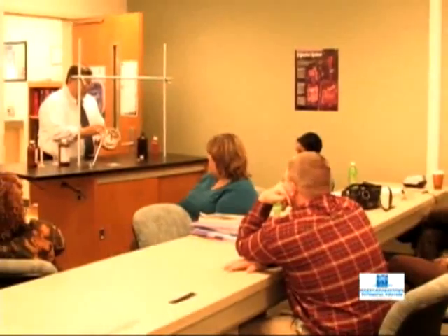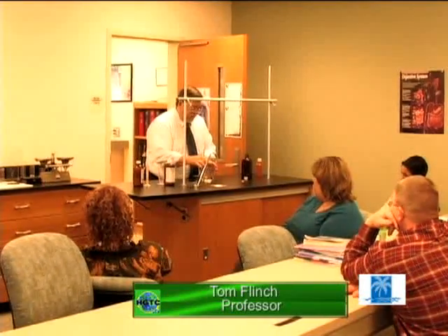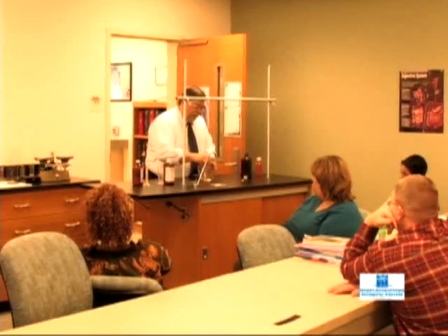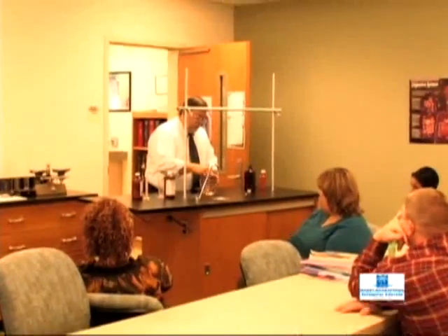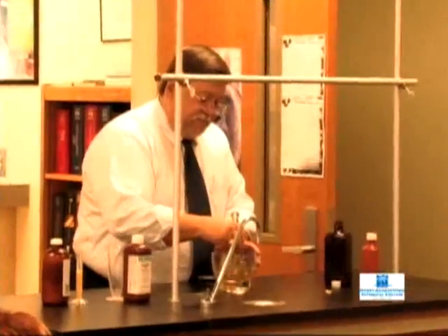Powder left on the bottom, okay? It's all gone into the Benadryl elixir. And we do this for about a minute to make sure that we give it enough time to totally dissolve.